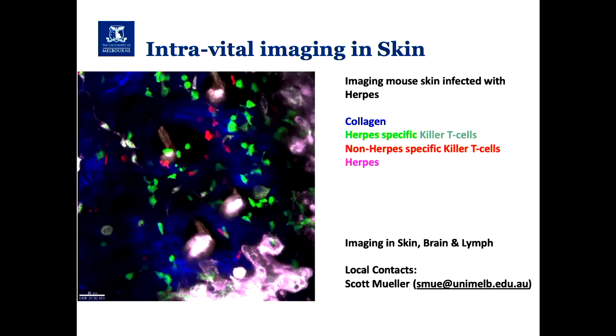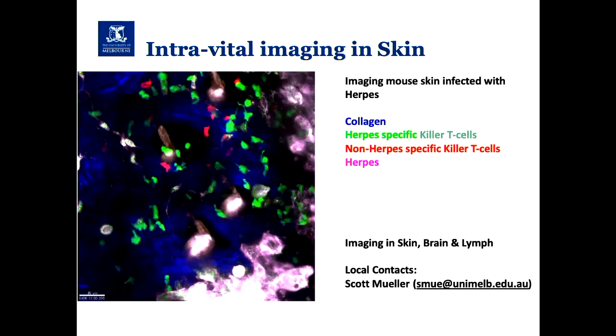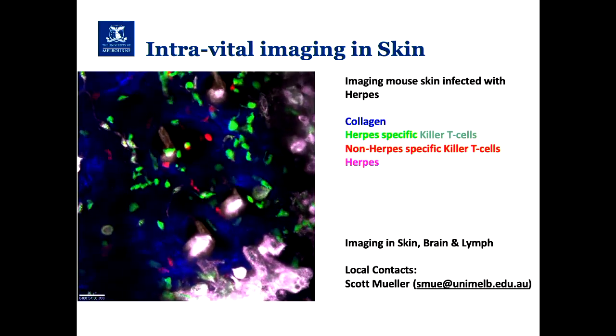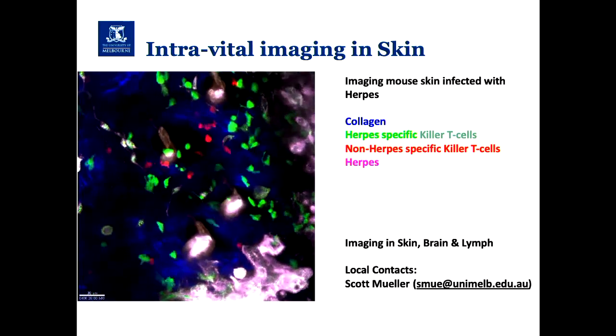Now I said we can penetrate deeper into samples. We have a limit of probably 500 microns. You can push to 1,000 depending on the tissue, but you're not going centimeters into the sample.